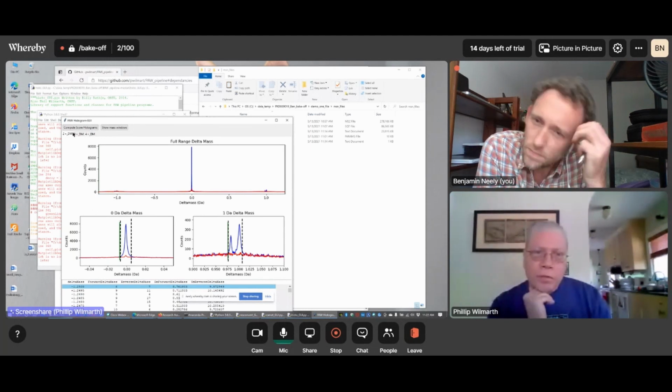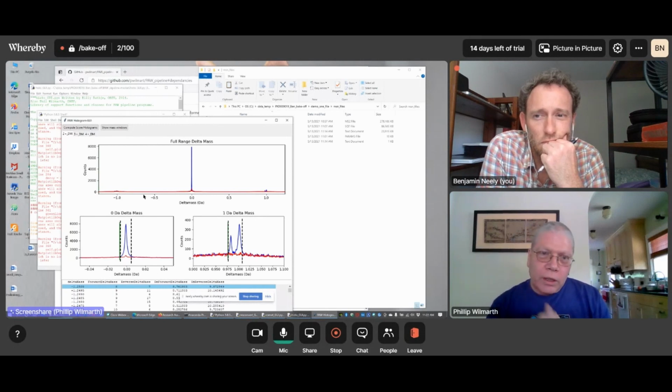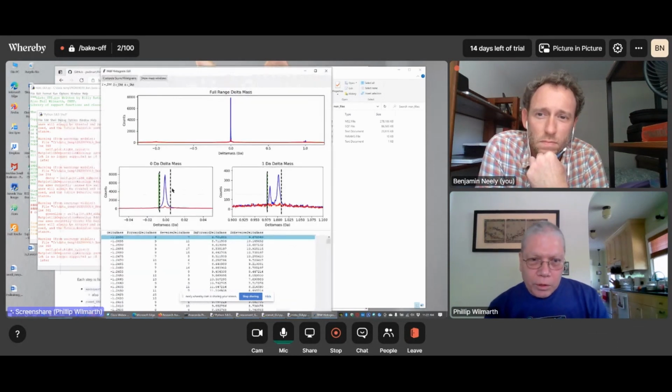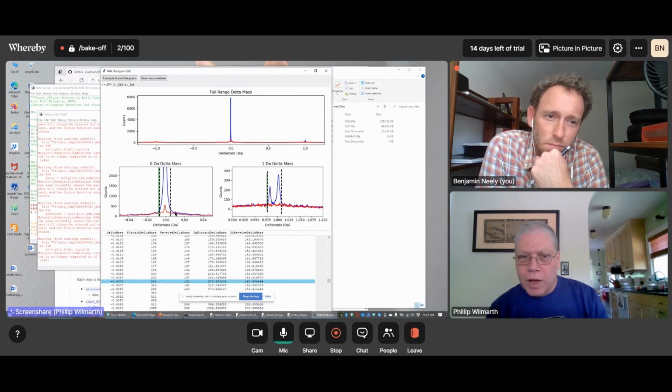So now what we want to do for each of our charge states is set a narrow window around our 0 Dalton region and a window around both of these peaks at 1 Dalton. And we can adjust these windows, I'll show you how. So here what we'll do is we'll expand the scale. If we just double click the axis there, we can kind of bring that up. And we see our dotted lines, which are where our thresholds are set by a default algorithm that kind of runs down off the peak and stops when it thinks it's down near the baseline. We could maybe broaden that out a little bit and capture some more of that peak.